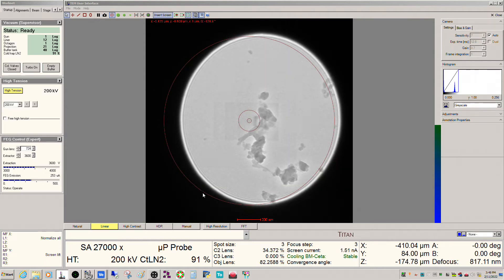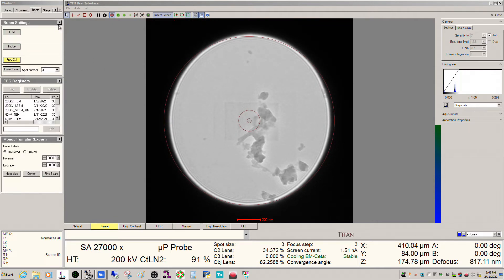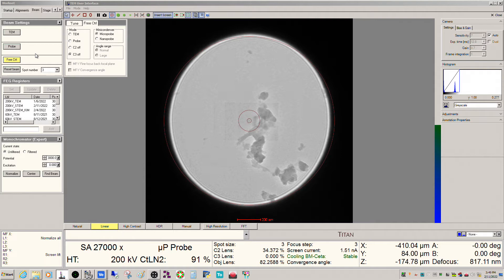So basically your options for the gun on a Themis are with or without monochromator, and then S-FEG or X-FEG. The fully loaded one is an X-FEG with a monochromator. As a result of that, there are a few things you have to understand regarding your day-to-day instrument operation. I already went through and applied the alignment file.